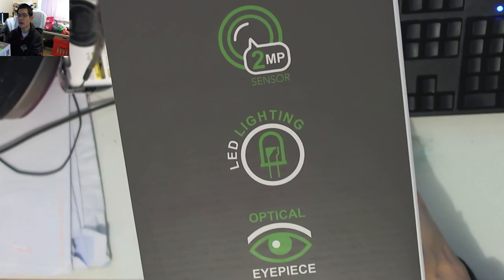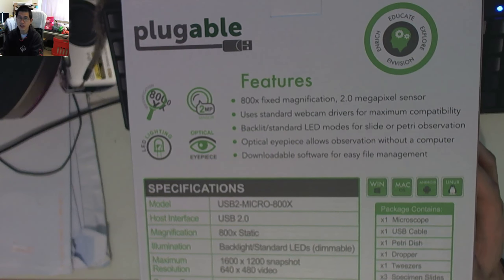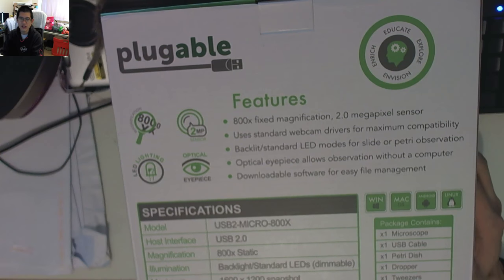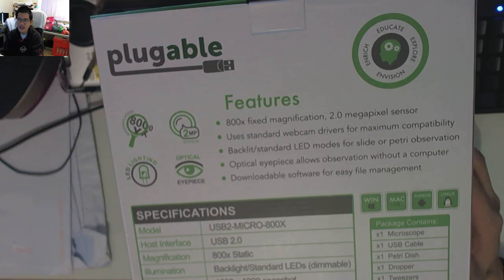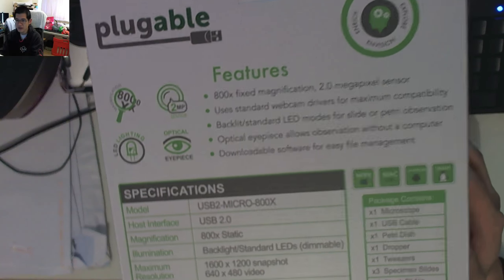On the side of the box: 800x, 2-megapixel sensor, LED lighting with an optical eyepiece. On the back it lists the features: 800x fixed magnification. That's actually a really interesting choice — having a fixed zoom will limit you in what you can see, but depending on what you're trying to see, fixed is perfectly fine. It also uses standard webcam drivers and has a backlit LED for slide or petri dish.